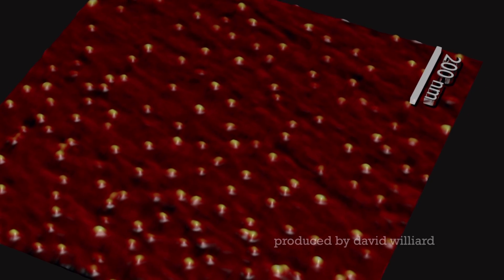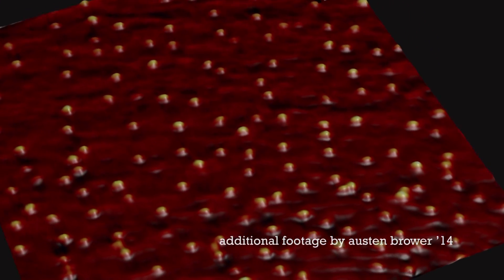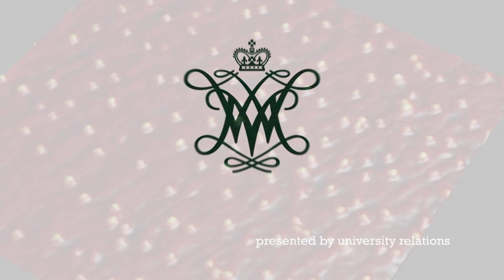This is a game changer in many ways because there's just no other way to produce a material with this shape, be it synthetic or biologically.